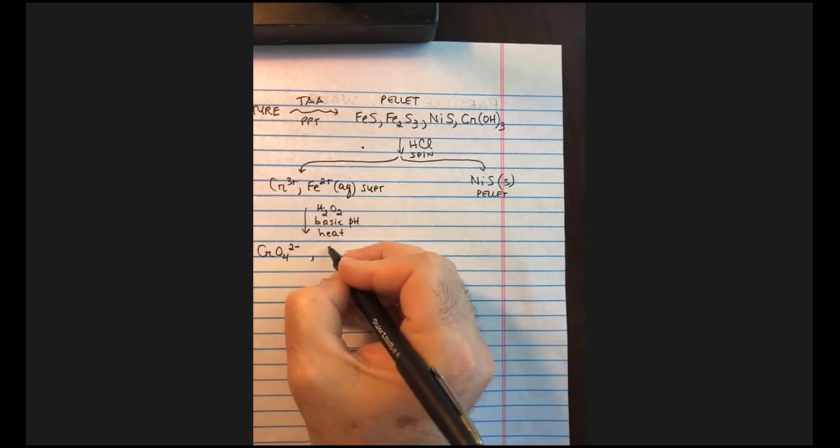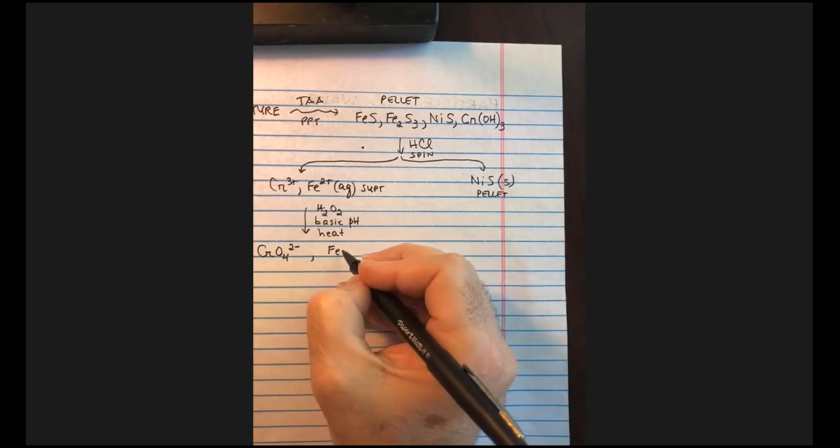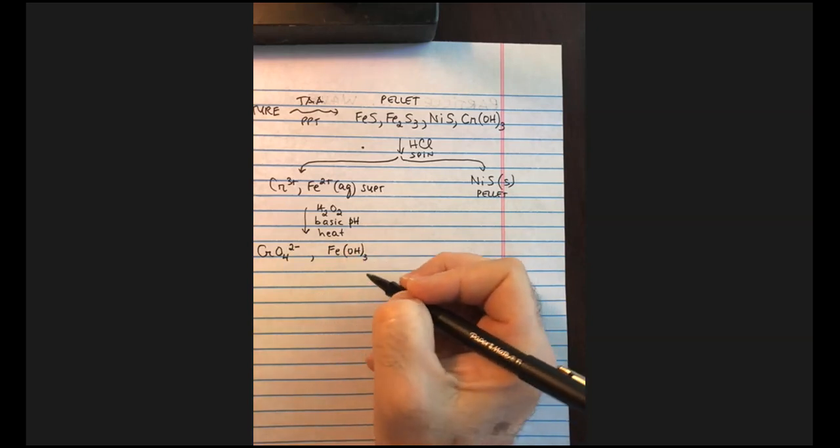Whereas in the basic pH, the iron ions essentially not only reoxidize, but they also form a hydroxide precipitate.